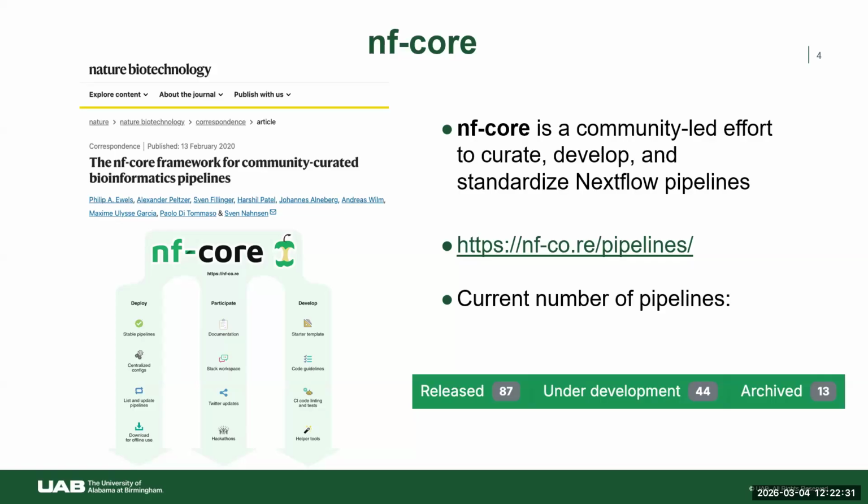They've done a really good job at involving different people across the globe to not just teach, they have training material, but also involve them in opportunities to refine their skills, such as hackathons, things of that nature. So this is what NF-Core is about. It's really this international community.